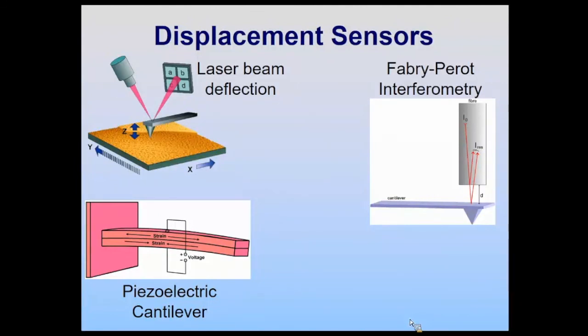Piezoelectric cantilevers take advantage of the inverse of the effect that we use for scanning in these systems. But all told, all of these typically end up with a noise floor that's on the order of a femtometer per root hertz, which, if you think about it, is pretty impressive, that you're able to measure sort of nucleus length scales if you wait for a second.